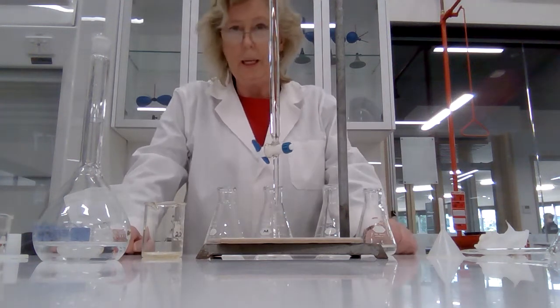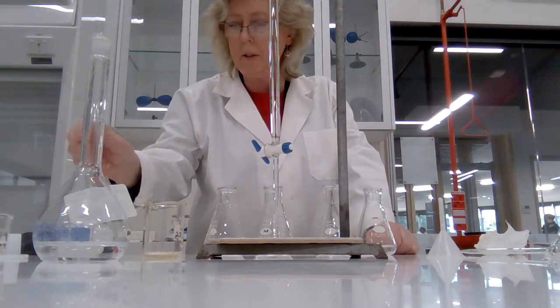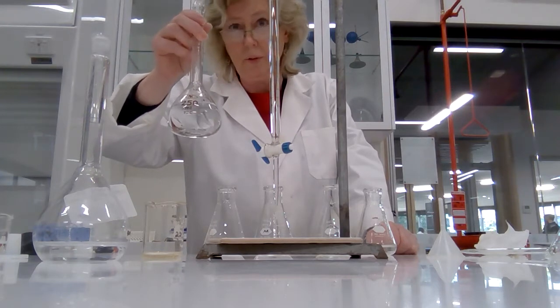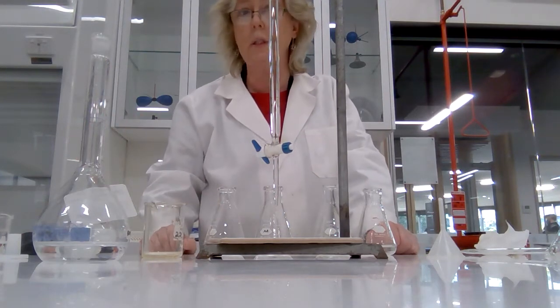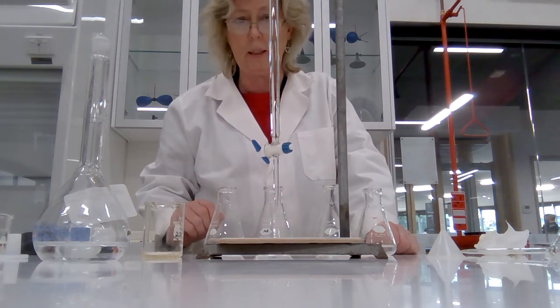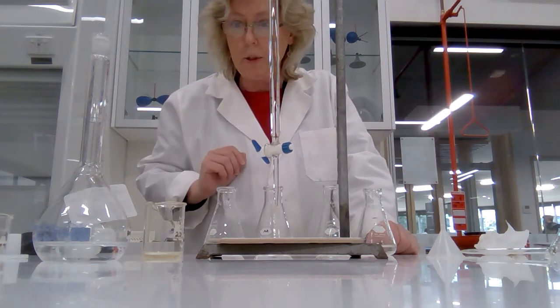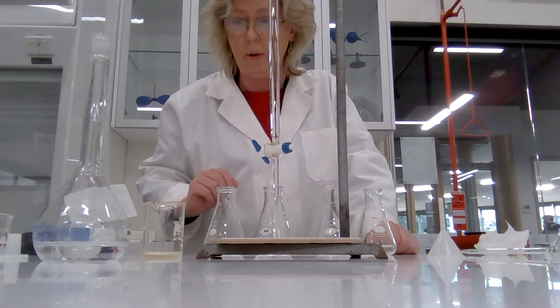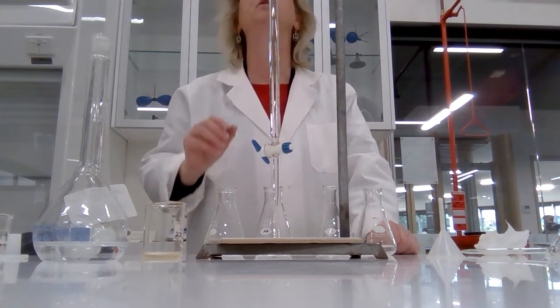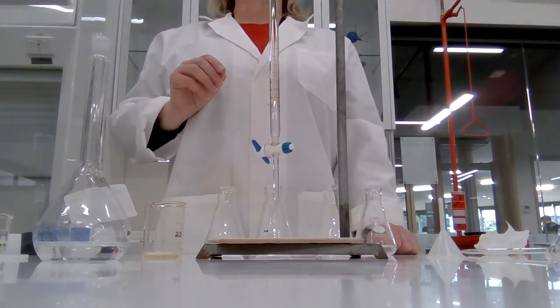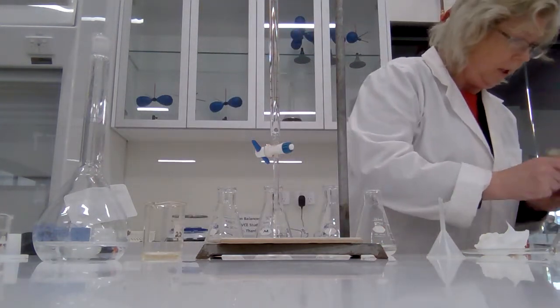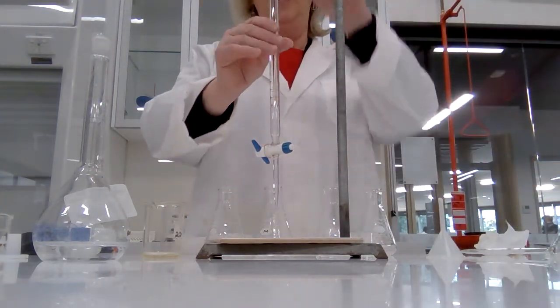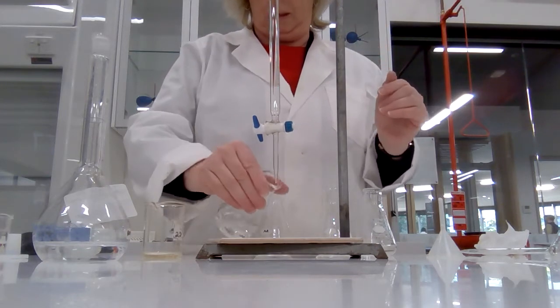All right, we are doing the titration of a vinegar solution that's been made up in the 250 ml volumetric flask with sodium hydroxide, which has previously been standardized at a concentration of 0.1036 moles per decimeter cubed. So the starting volume is 1.90 milliliters, and let's see how good we can be with this.